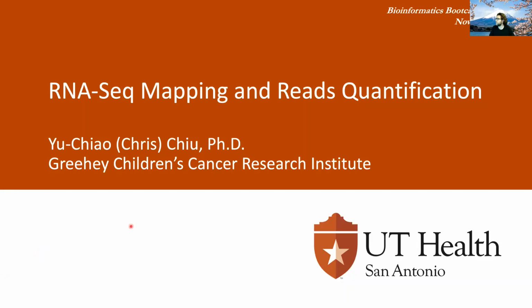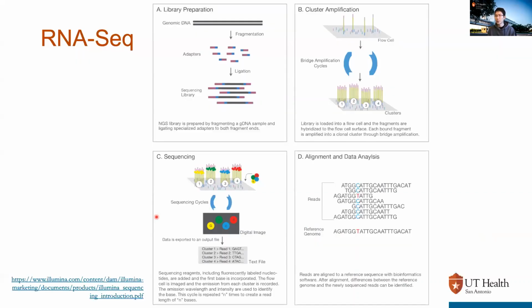Okay. So today I'll be talking about RNA-Seq mapping and read quantification. Mostly, almost 80%, will be using Linux. And okay, first let's very briefly talk about RNA sequencing.